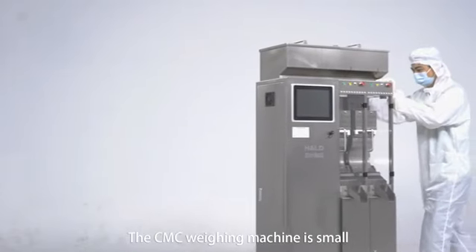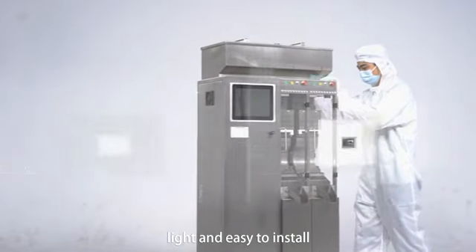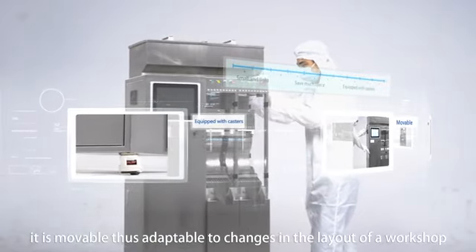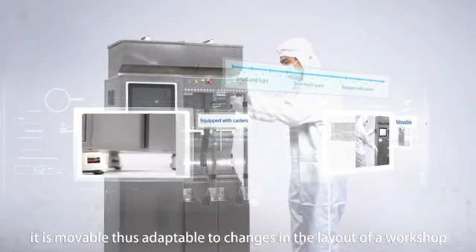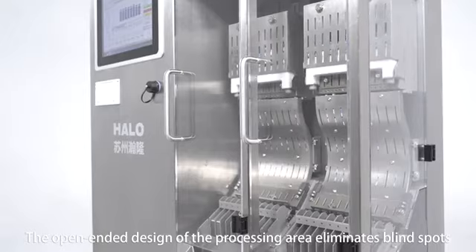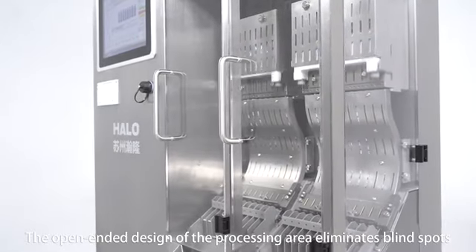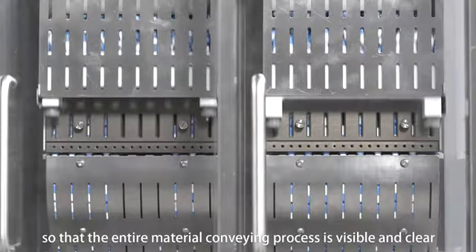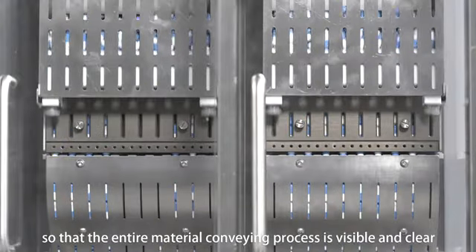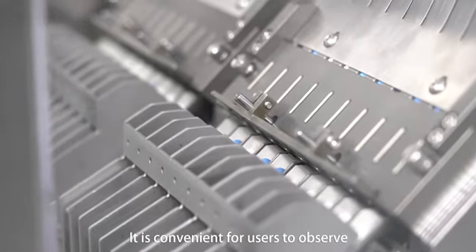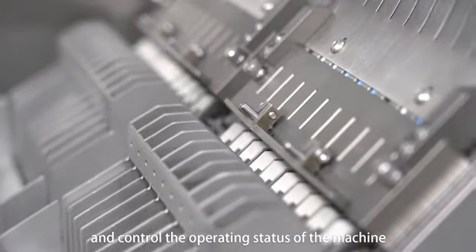The CMC Weighing Machine is small, light, and easy to install. Equipped with casters, it is movable, thus adaptable to changes in the layout of a workshop. The open-ended design of the processing area eliminates blind spots, so that the entire material conveying process is visible and clear. It is convenient for users to observe and control the operating status.